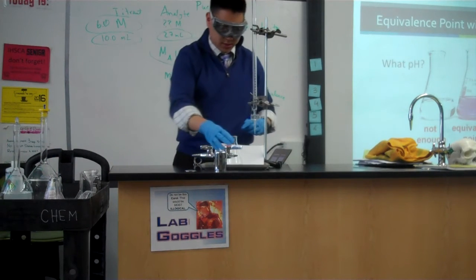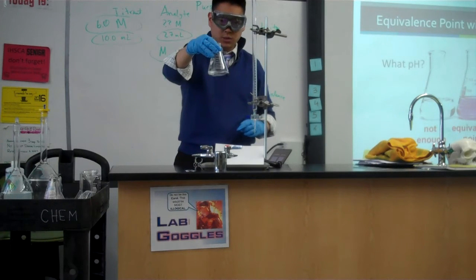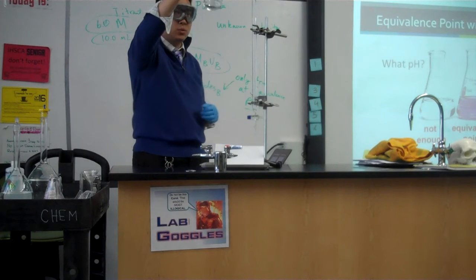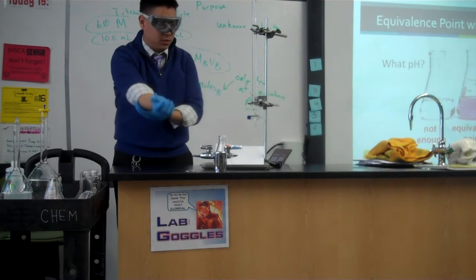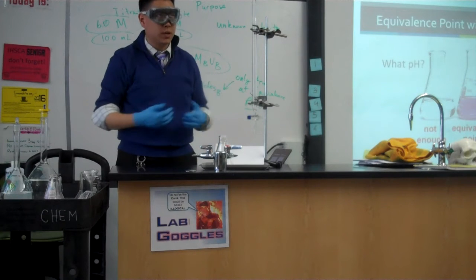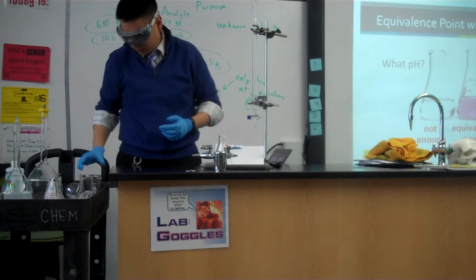Alright. Swirl it around, make sure it's all mixed up. And just like we were expecting, if it's acidic pH, it will not have any color. Good. Now, this is going to be the first time that you're using a burette, so the first thing we want to do is make sure it's nice and clean.